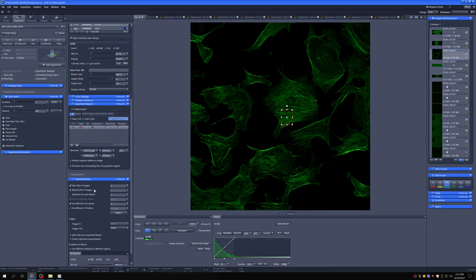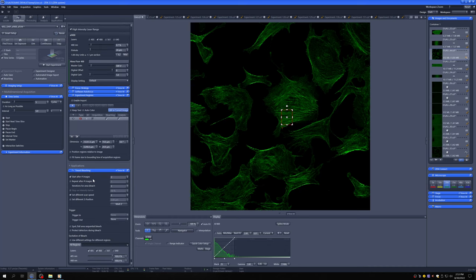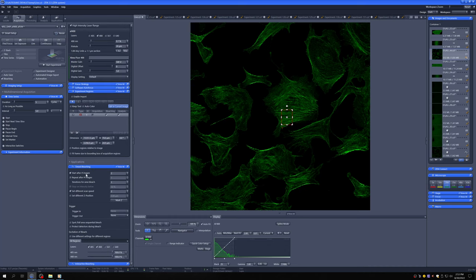And then for the timed bleaching application, which is the simplest one, you have to decide, obviously in coordination with the time series, when you want to start the bleaching. So I'm going to start after two images. You want to set a different scan speed, and you definitely usually want to set it to a lower scan speed than what you're using to image.